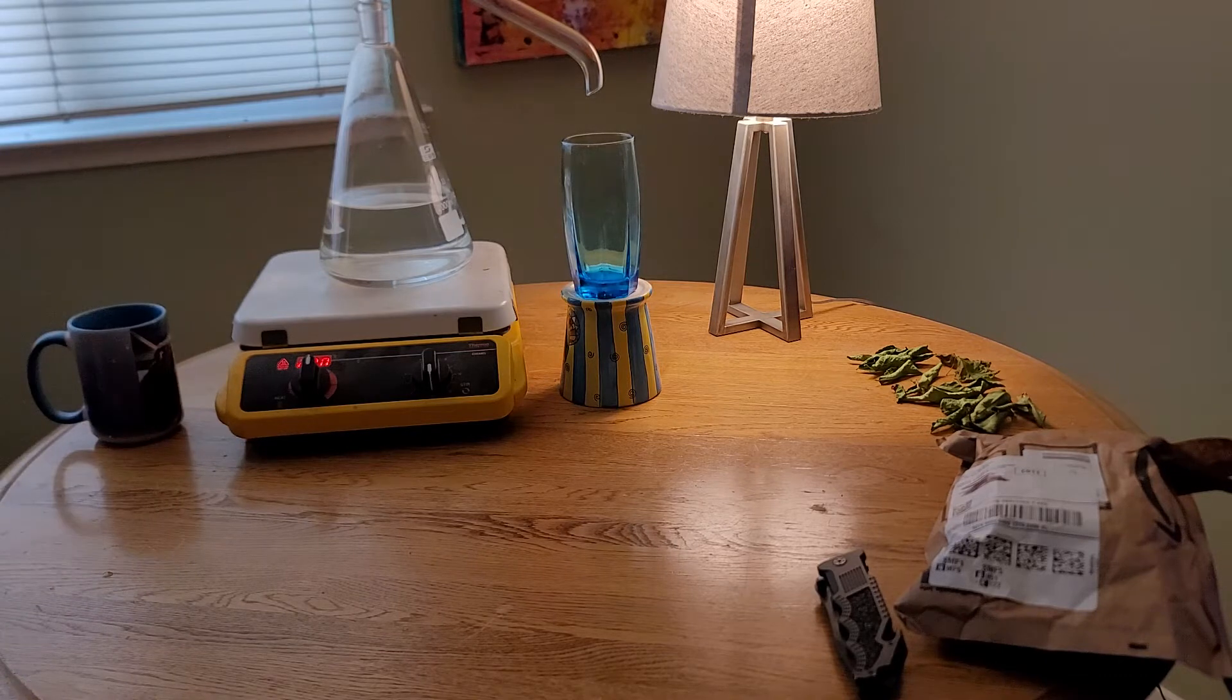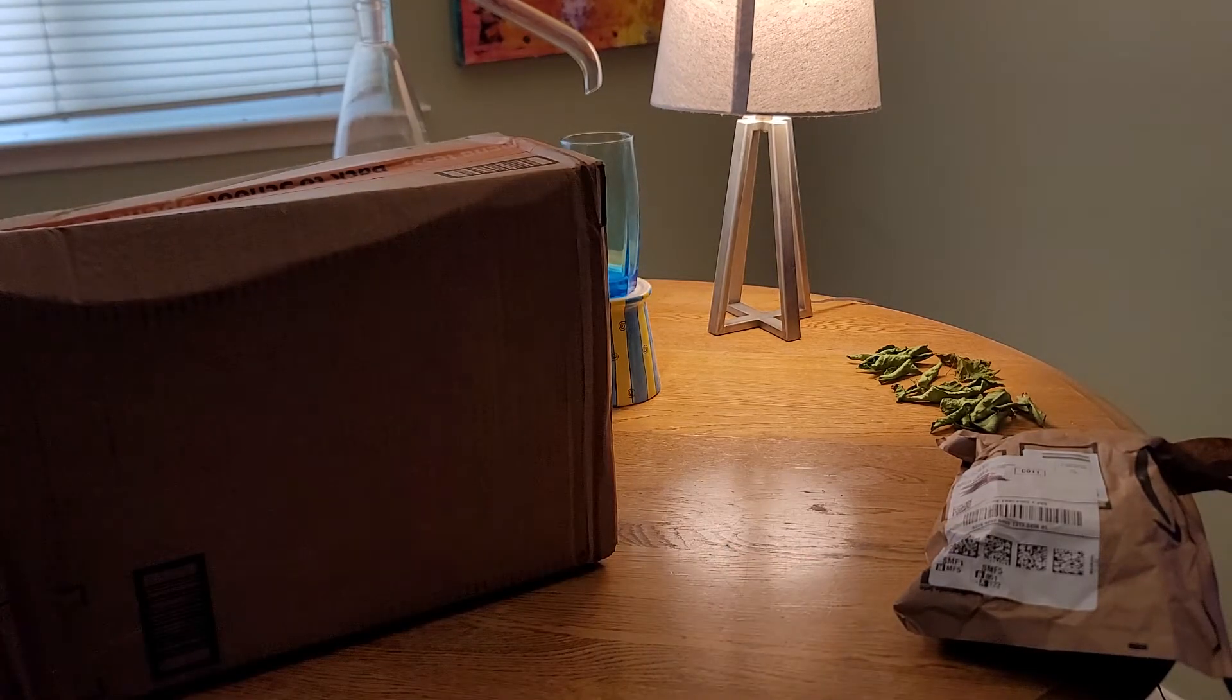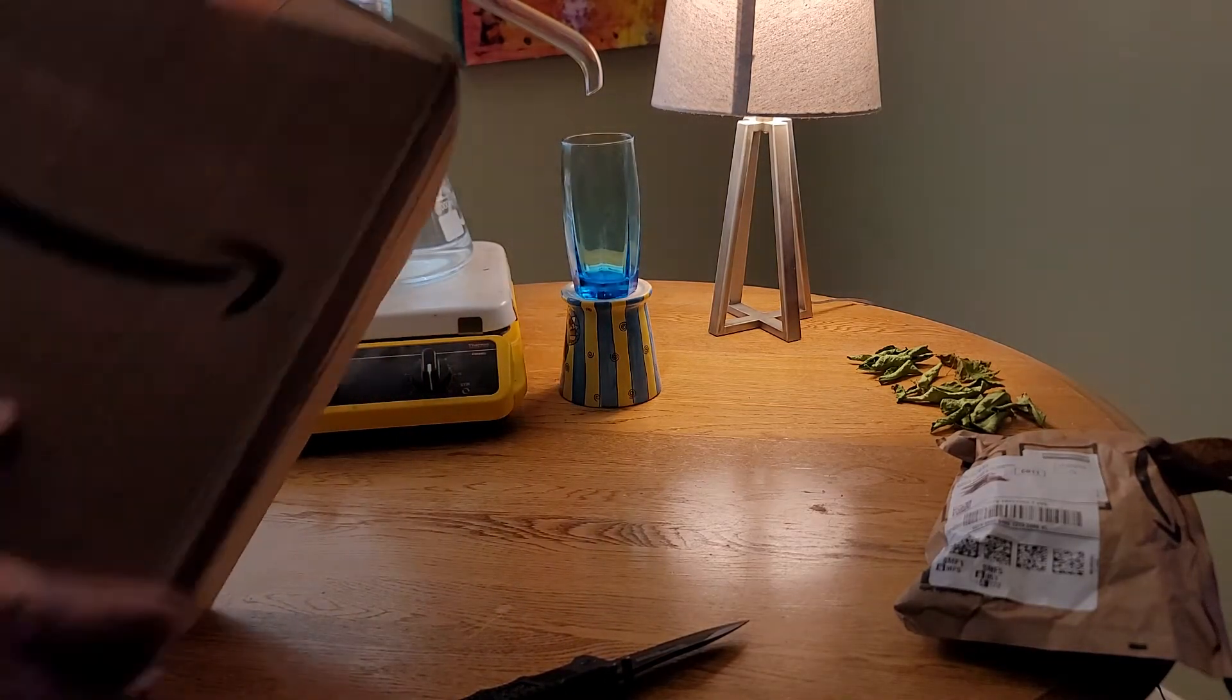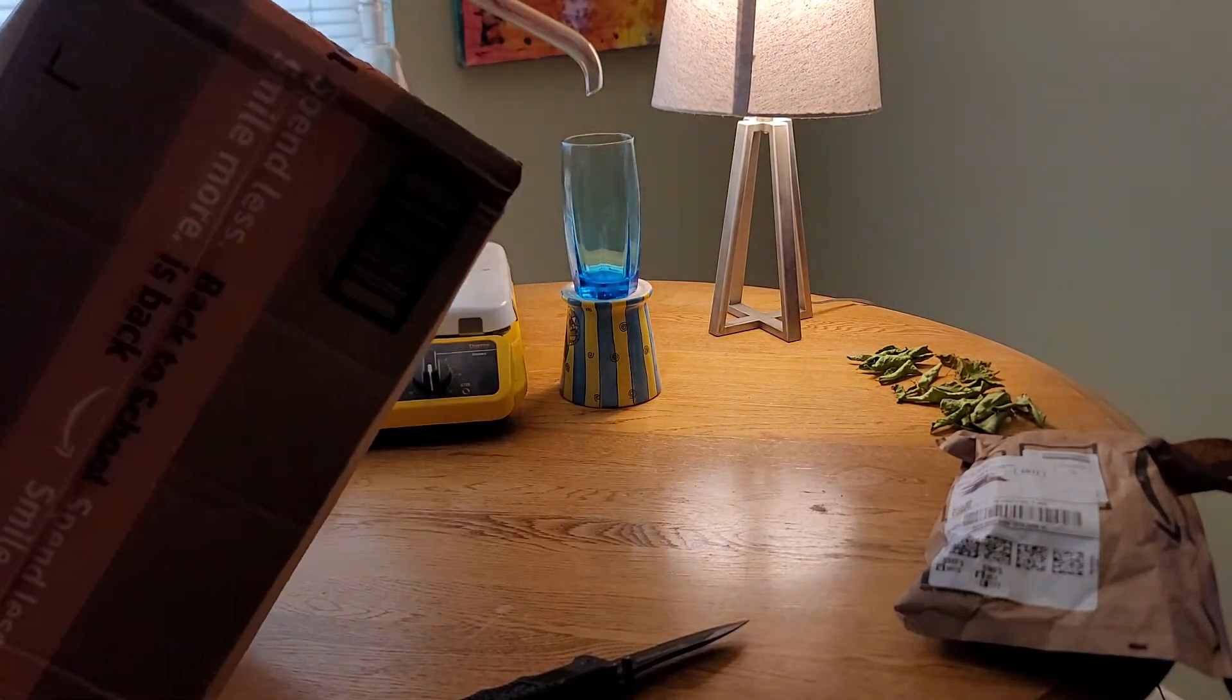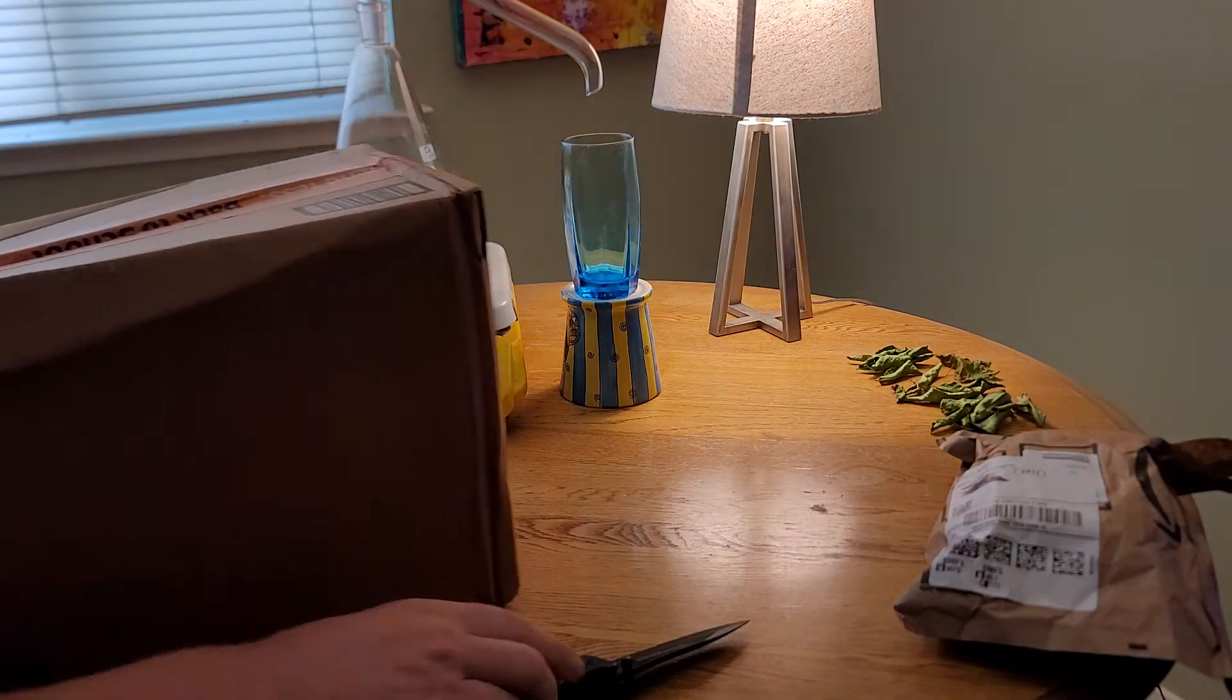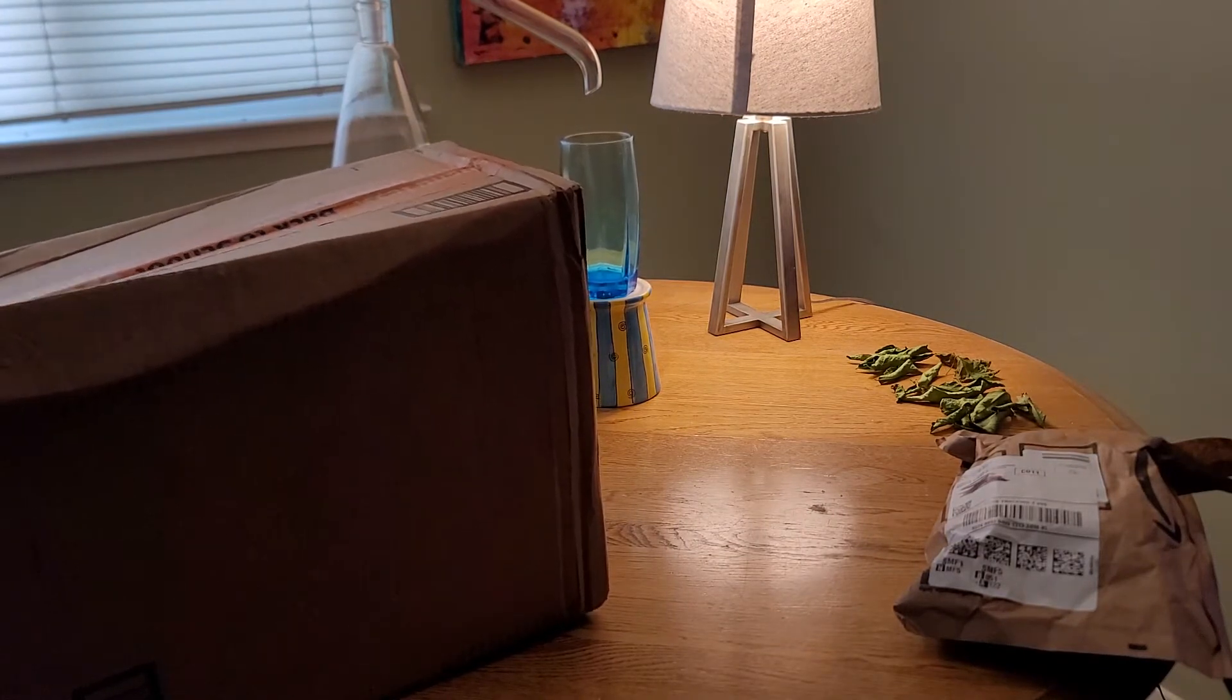Just having some coffee and I'm going to open some boxes that I received from Amazon.com. This is Glassworks from Alchemy. Some of these are from Avogadro's Lab Supply, but they are all ordered from Amazon.com.